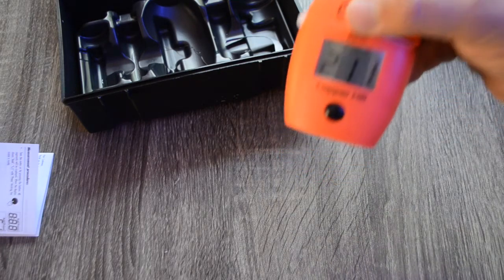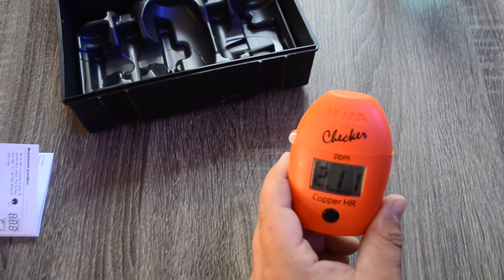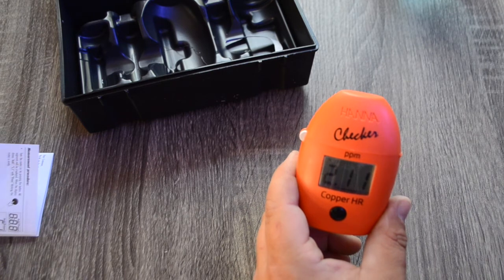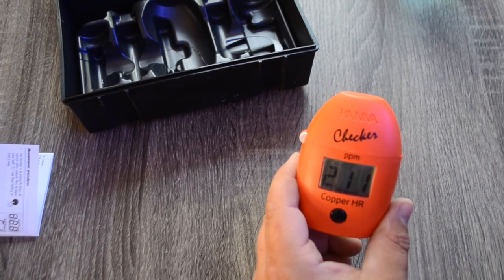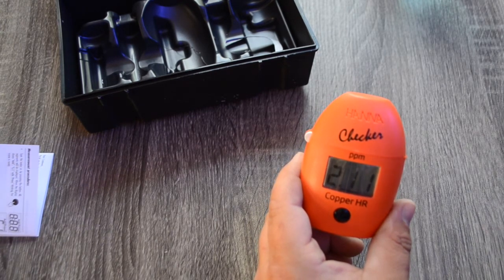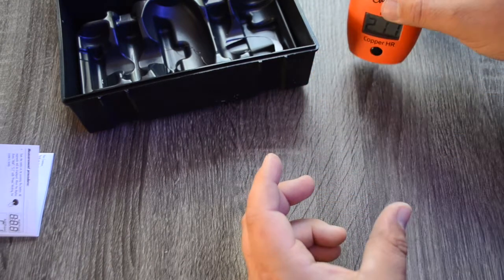I got the reading 2.11, which is just below the recommendation for that copper treatment to have your tank sitting at. With this, you can dial it in like we've never been able to before when it comes to quarantining fish and using copper treatments. The Hanna checker copper high range is an absolute monster and it's going to step up your quarantining. I definitely recommend taking a look at this if you are quarantining fish or looking to set up a quarantine tank using copper treatment.